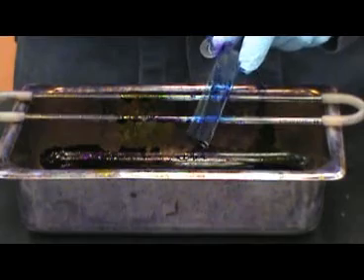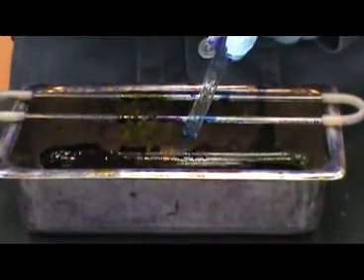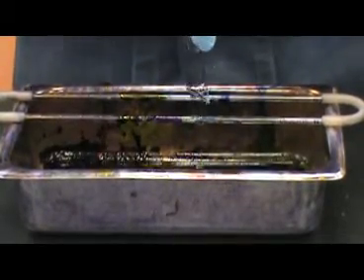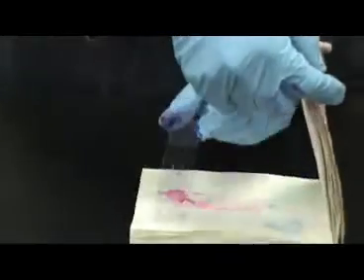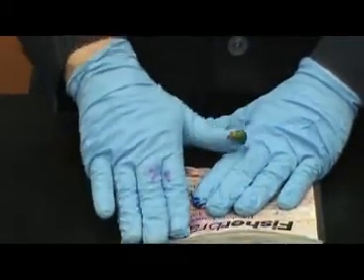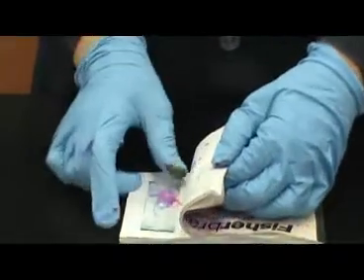The counterstain is methylene blue. Allow the methylene blue to sit on the slide for 1 to 2 minutes. Carefully rinse the methylene blue with water. After rinsing, the slide is now ready for drying. Bibulous paper is used. The book of bibulous paper is opened, the slide placed in, and the book is tapped or gently rubbed to dry the slide. Do not wipe the slide with a paper towel.